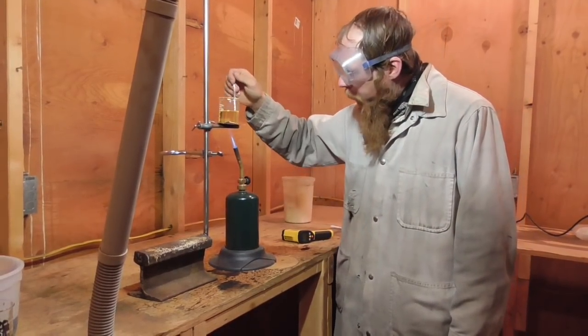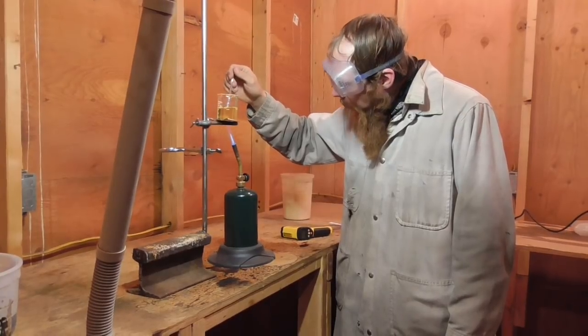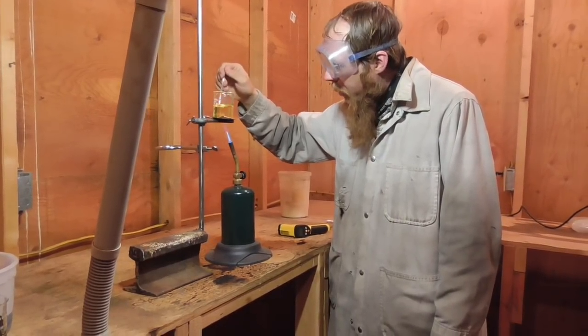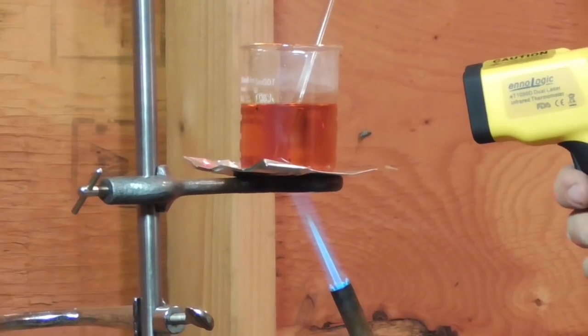Now we're at about 240 degrees Fahrenheit. The sulfur has melted and turned brown on the bottom of the beaker.